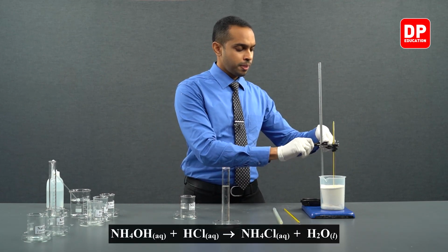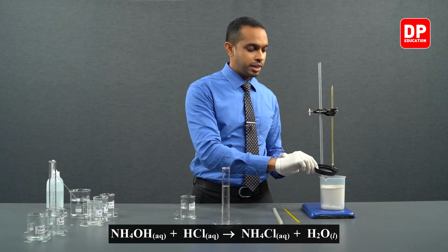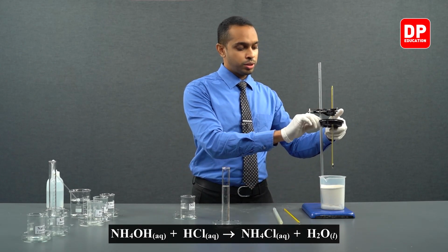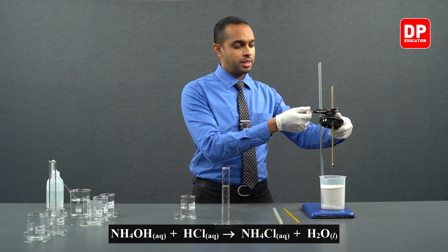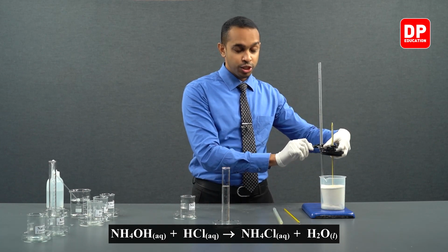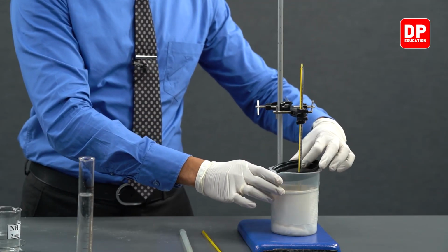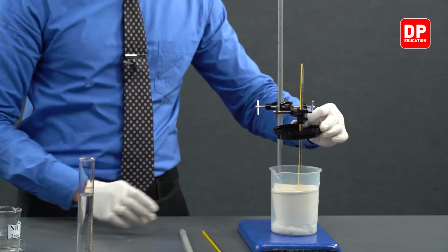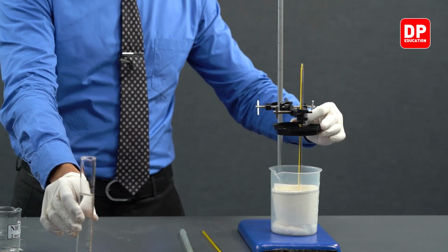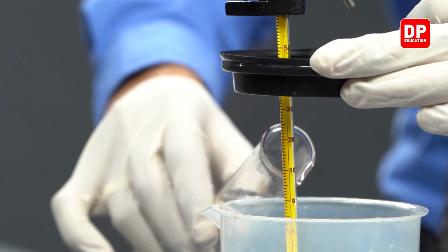Now we are going to add this ammonium hydroxide into the HCl solution we have here in the plastic container, and we are going to close the lid and measure the temperature reading we obtain as soon as we mix the two reactants together. So let's add ammonium hydroxide into this container.